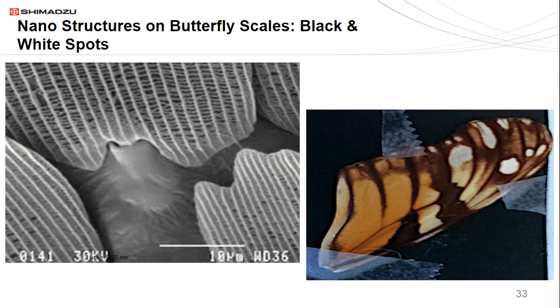So let me finish up this webcast with a topic that I hope you'll find both interesting and fun. One of the more innovative areas of nanoparticle research is putting things like transparent metal oxides onto substrates. It's used in the solar industry to try and bend and focus light on solar cells, but there's a lot of people looking to put nanostructures and adhere it to a surface rather than just impregnating it.